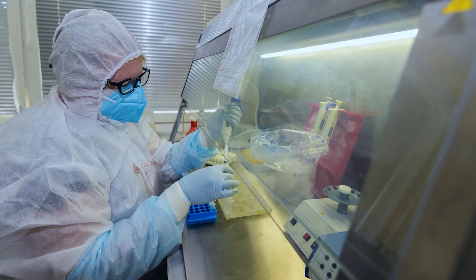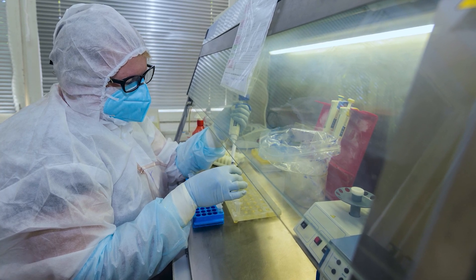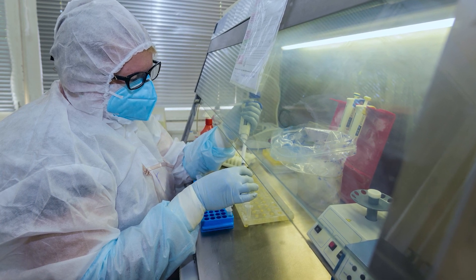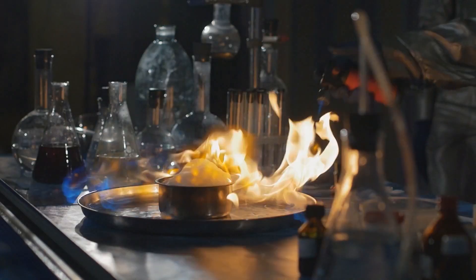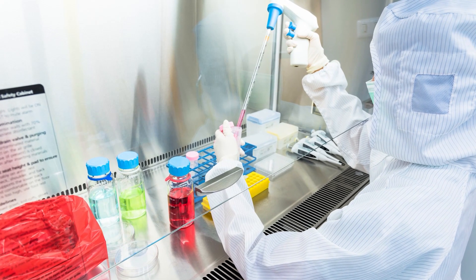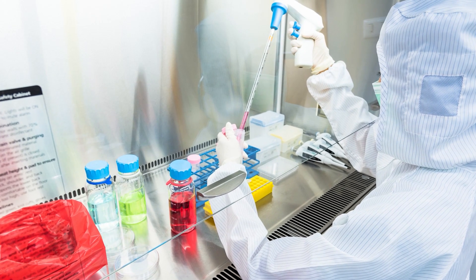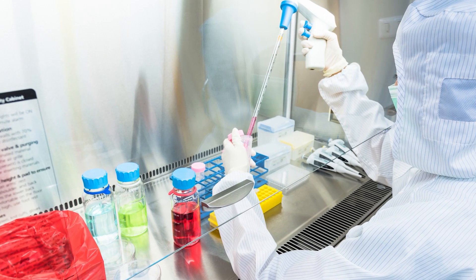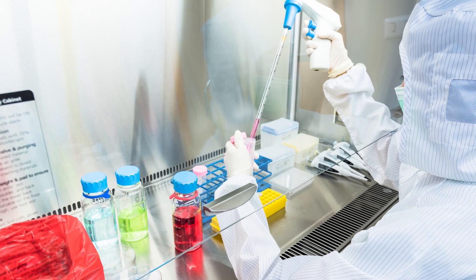Apart from serving as a ventilation system, this device also acts as a physical barrier. It protects lab personnel from inhalation exposure, chemical spills, runaway reactions, and fires. By containing and exhausting harmful contaminants, these enclosures serve as a vital line of defense and significantly lower the chances of inhalation exposure and subsequent health risks.